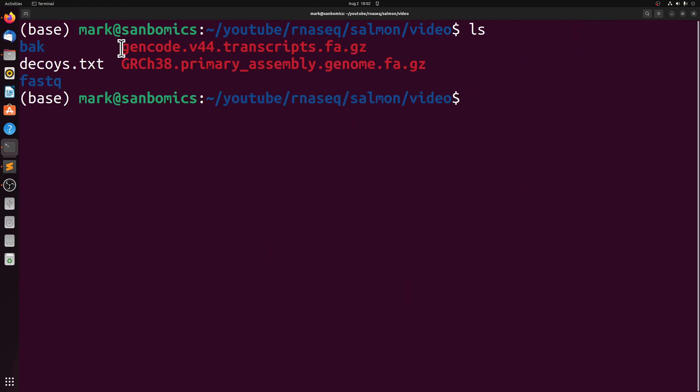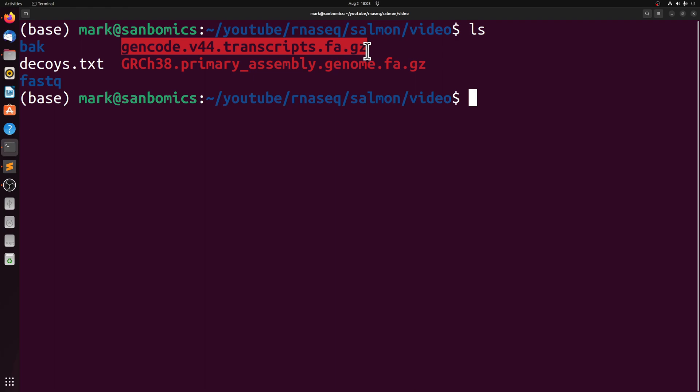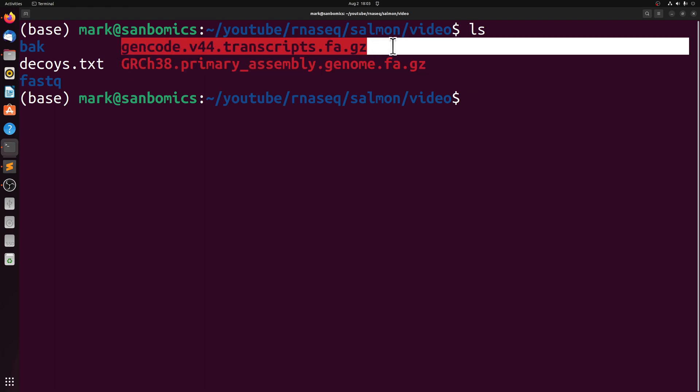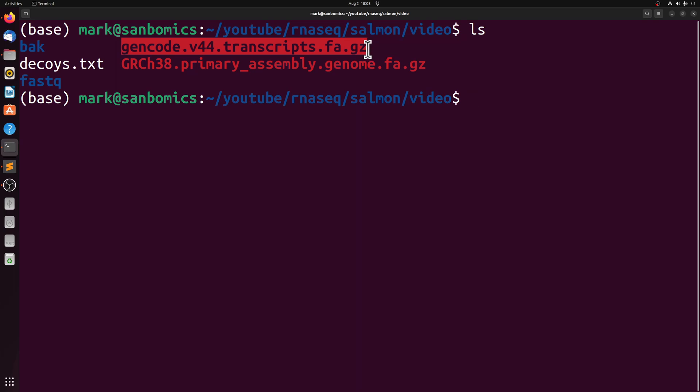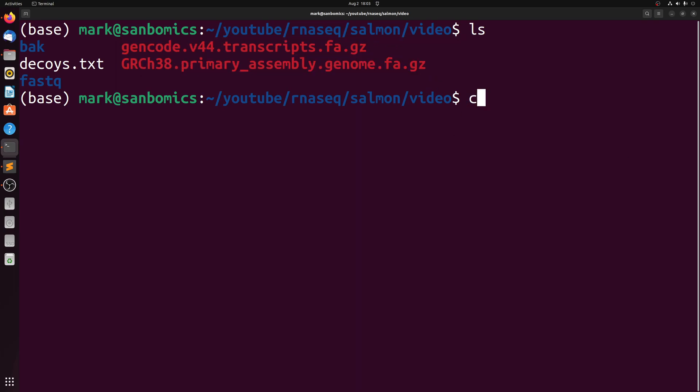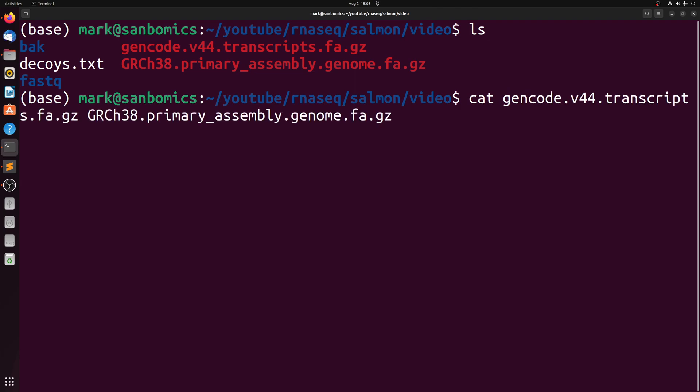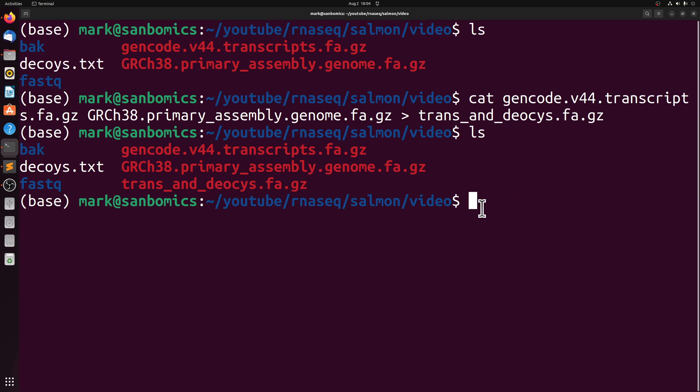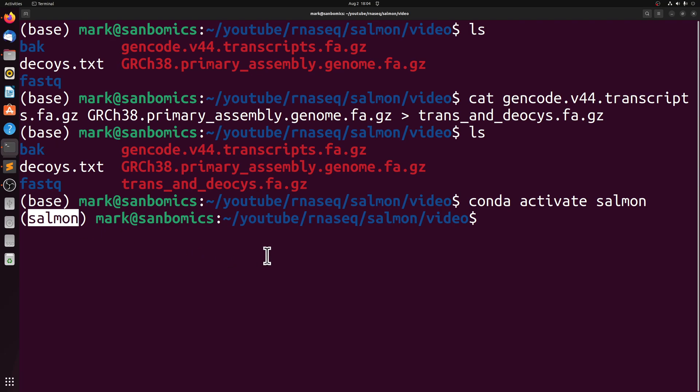The next thing we're going to do is we need to combine the two FASTA files together. The order here is important, so we need the transcripts to be before the decoys sequences. So we're going to cat GenCode transcripts onto the primary assembly, and we can call it whatever we want.